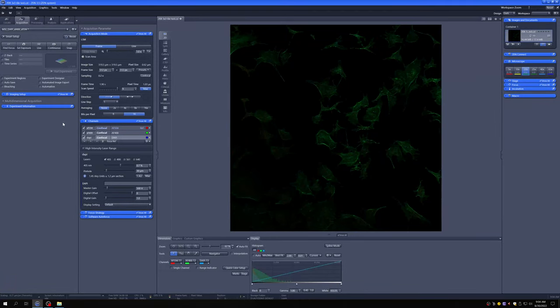Once you have loaded a setting, the very first step you need to undertake is to make sure that the pinhole size is set correctly. Let's discuss why this is important.